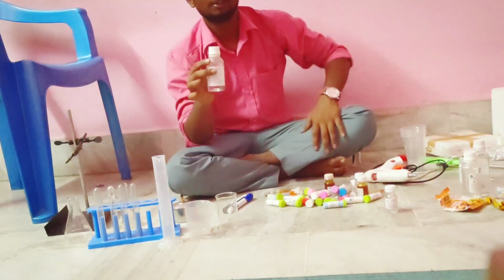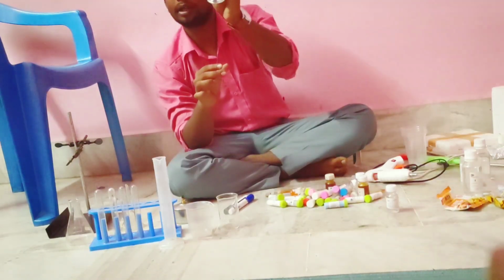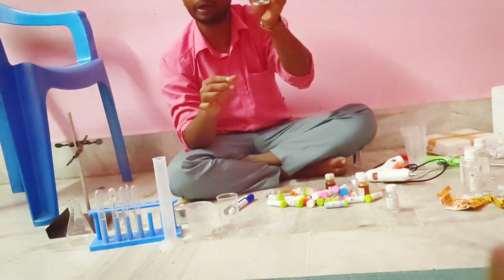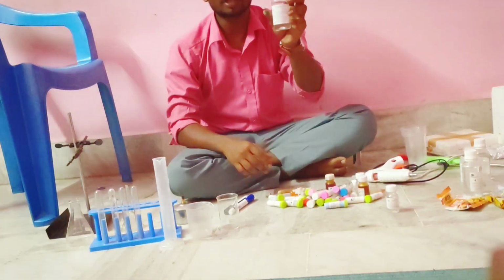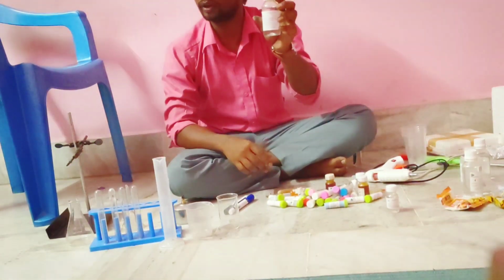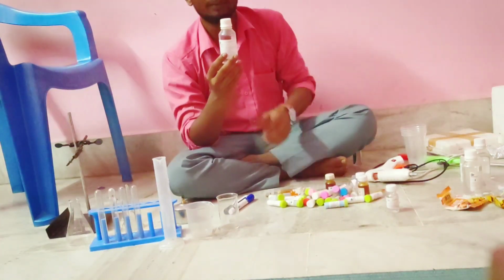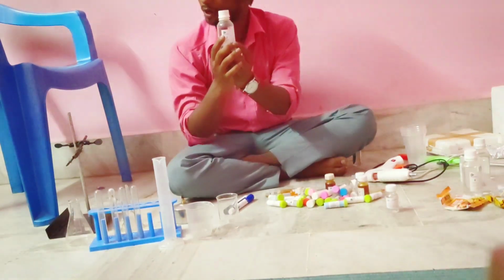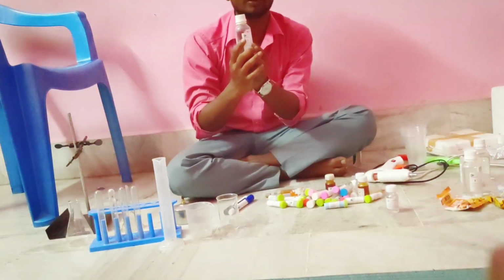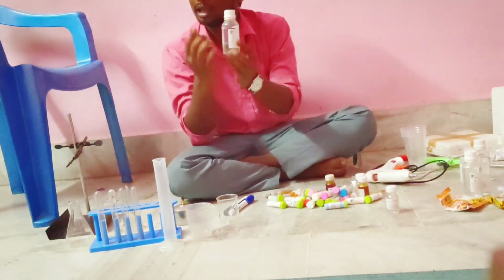Okay, so it is called diluted hydrochloric acid. When I'm saying diluted hydrochloric acid, I'm saying the lighter version of hydrochloric acid. There will be a version, it could be concentrated, it could be diluted. And when I'm saying diluted, that means hydrochloric acid is less in the solution. Right? Hydrochloric acid is less in the solution.